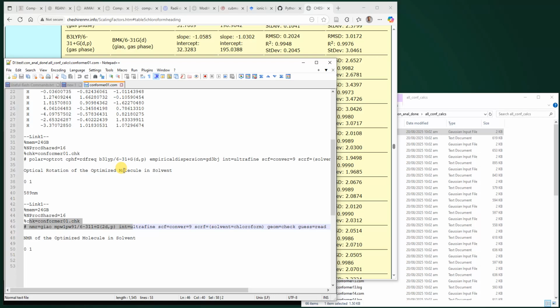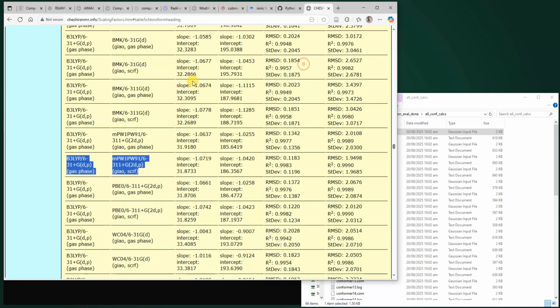It's not a very long calculation. It takes less time, but it gives you a good idea of comparison of structures. Like if you look at two structures and they got the same optical rotation values, it means they are identical. I mean, you can then look at the energies and the structures themselves, but this gives you a quick idea, so it doesn't do any harm to put it in the calculation, and you have to give the wavelength at which you are measuring the optical rotation of the molecule. So this was about the website, like how you get all these methods.